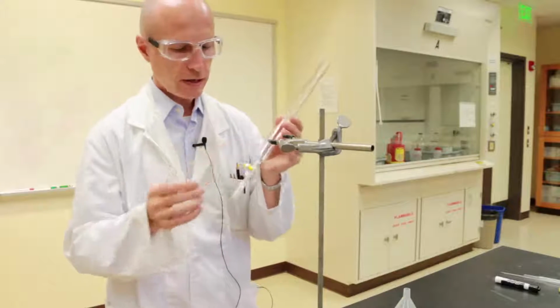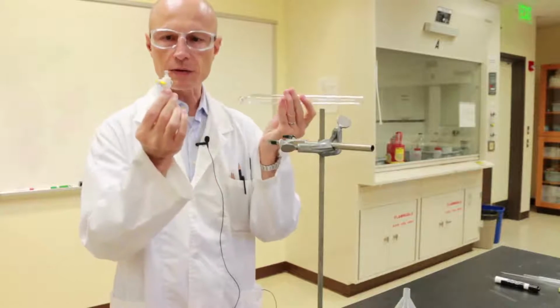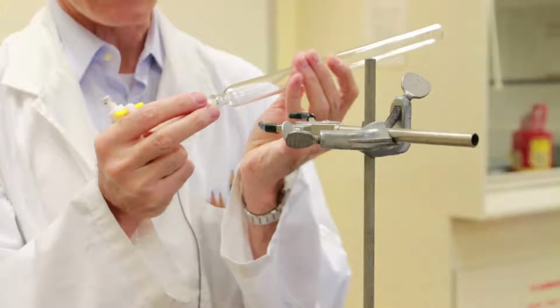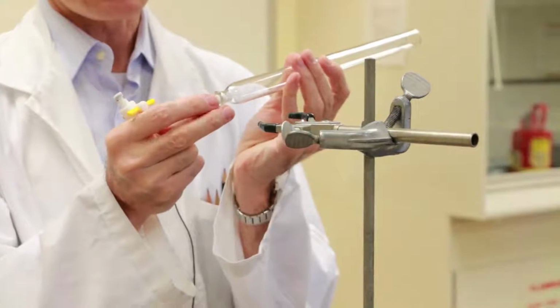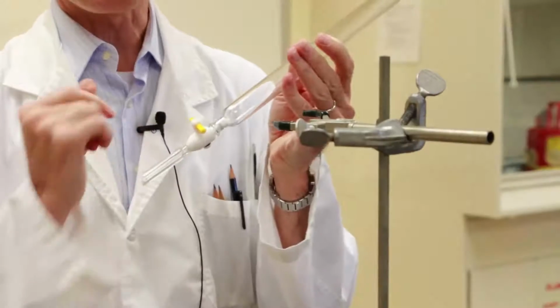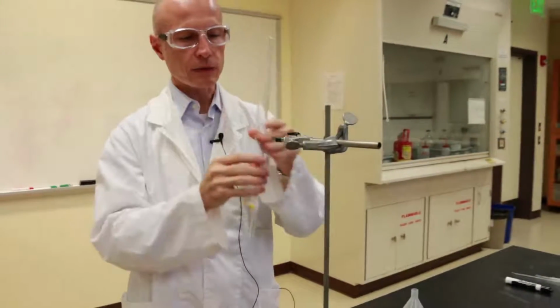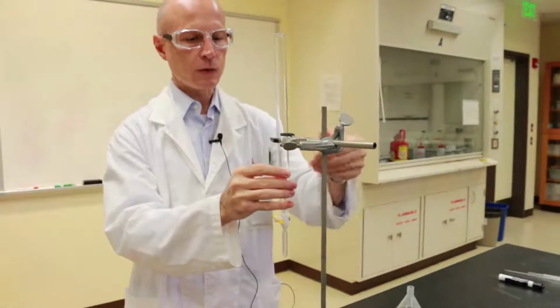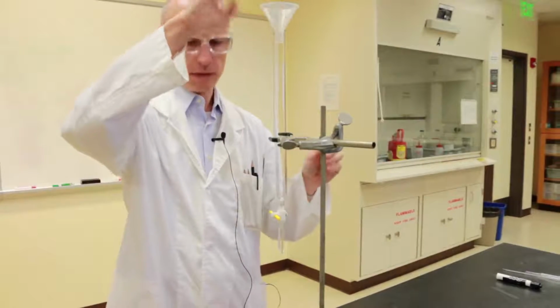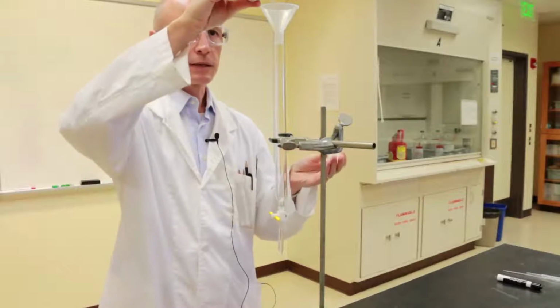The columns we have here are actually very handy because the stopcock comes out. The very first thing you want to do is take a very small cotton plug and put it at the bottom of the column. And then you carefully reinsert the stopcock. This will prevent the sand from going down the stopcock. And then you want to clamp the column. You put a powder funnel on top and you put in sand.